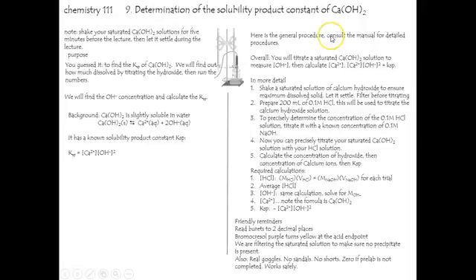Okay, here's the general procedure. I have left out some of the details now that we've been doing this many times. Things like conditioning the burette, etc., are not listed in this procedure. However, fear not, because if you follow the listed procedure, it is basically cookbook, and you can just do what it says, and you should be able to get excellent results.